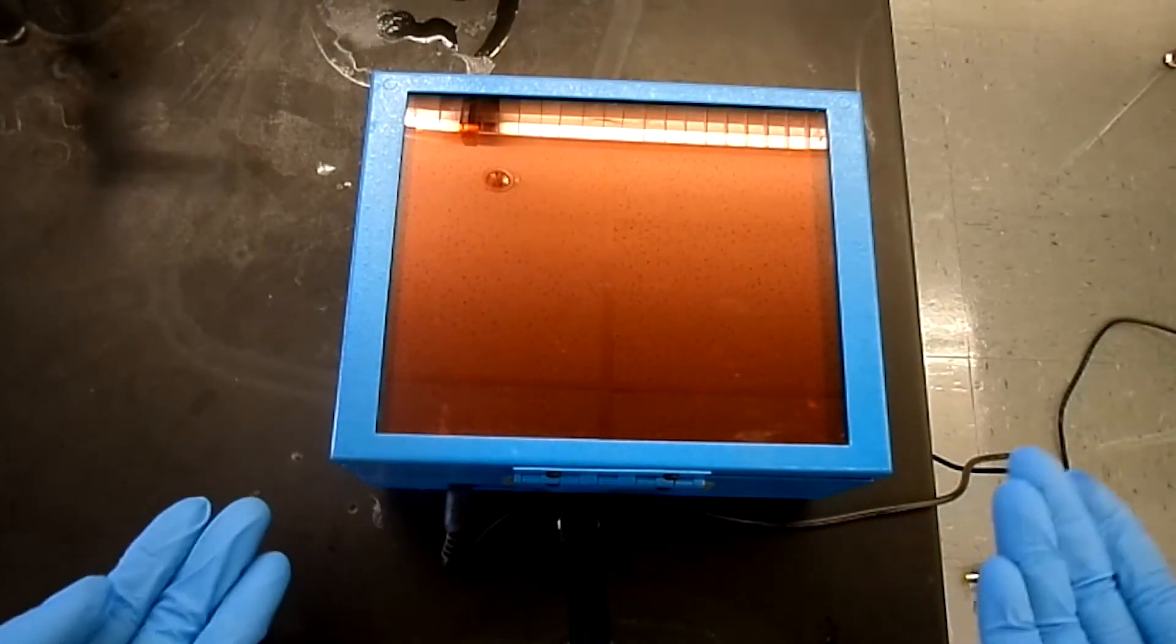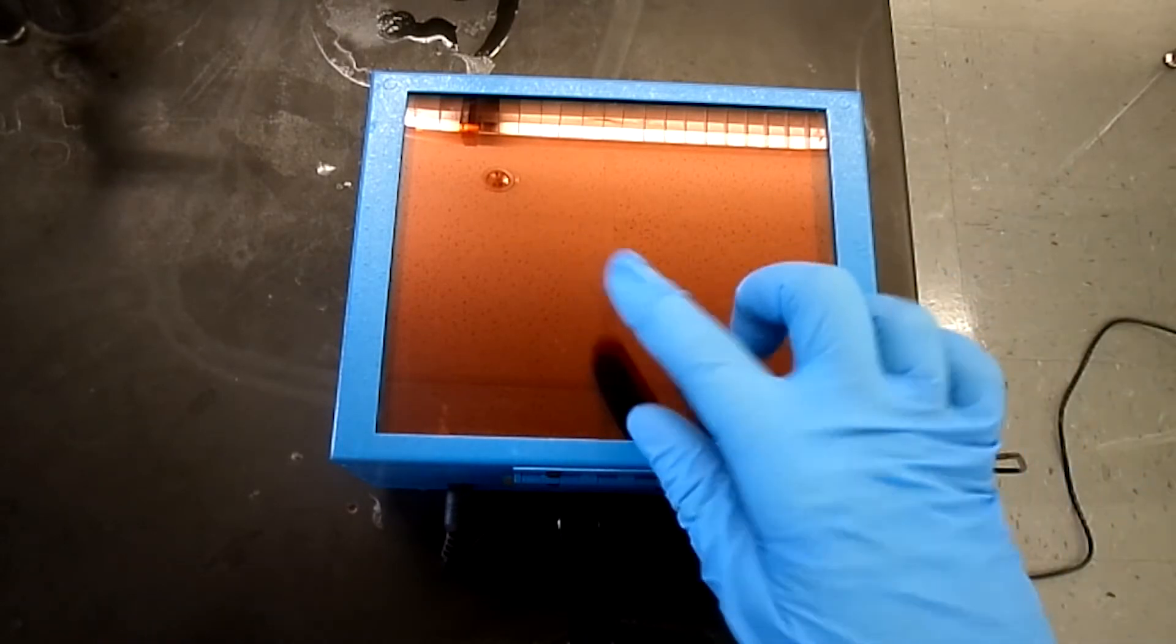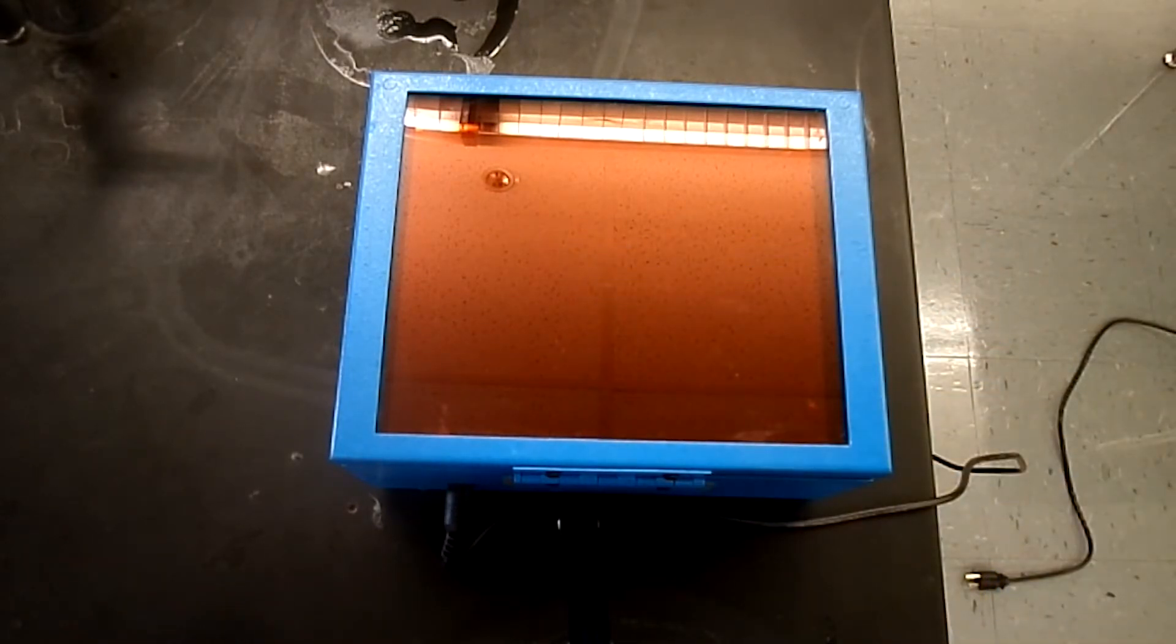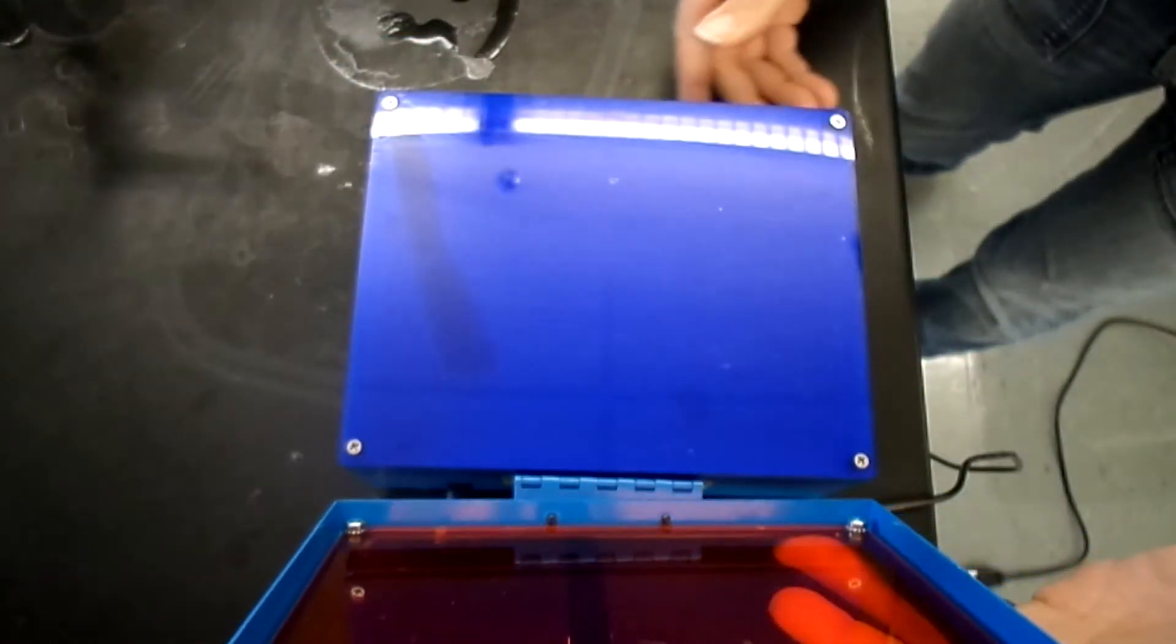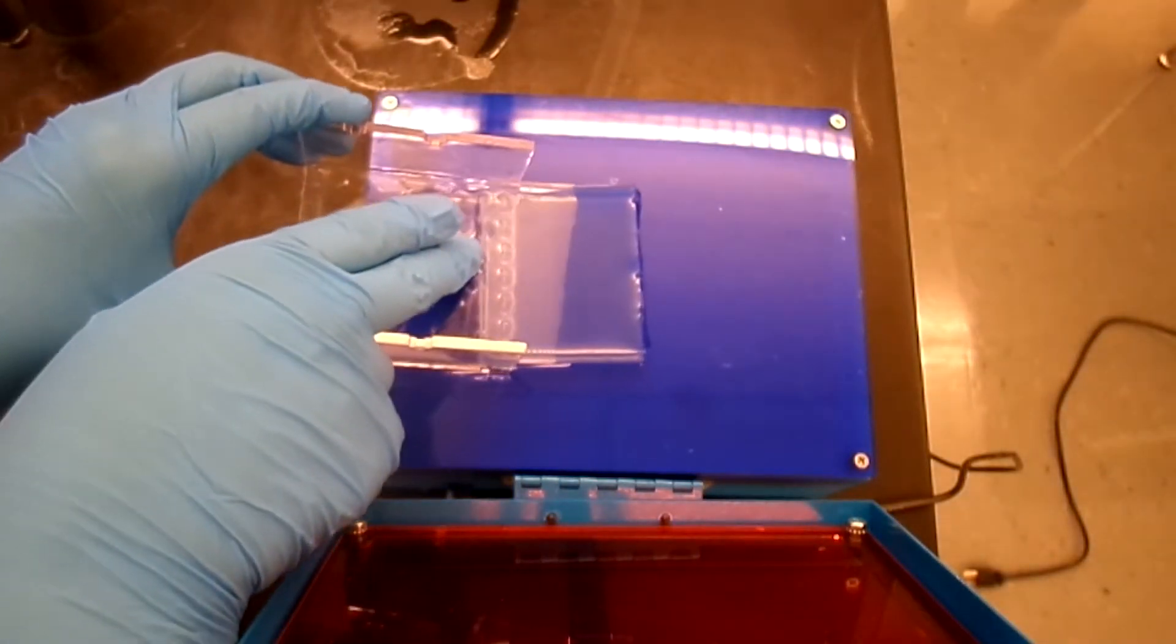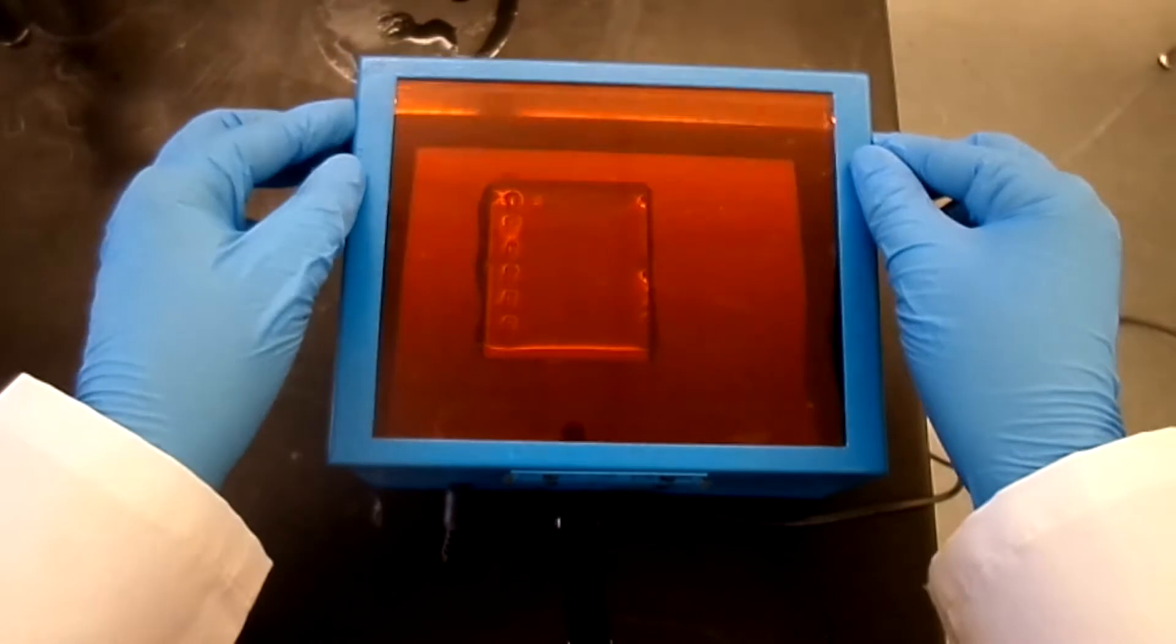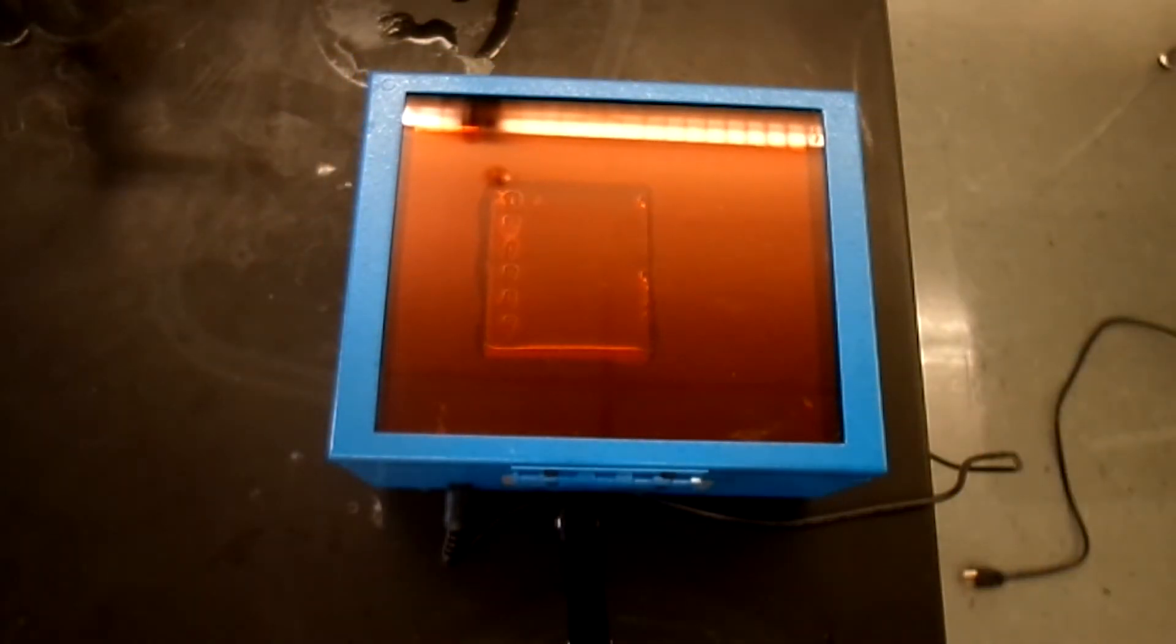This is our transilluminator, which we will use to look at the DNA. We're going to take our gel and put it on here and then turn off the lights. Now we're going to close the top and turn it on.